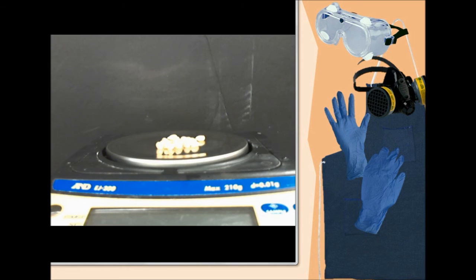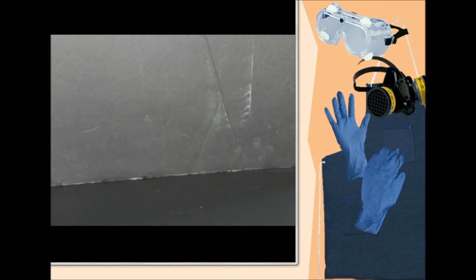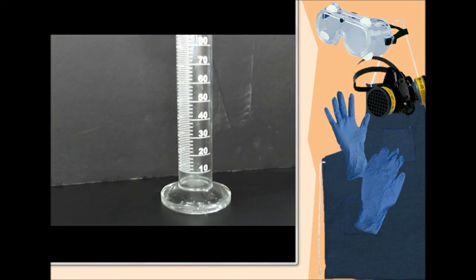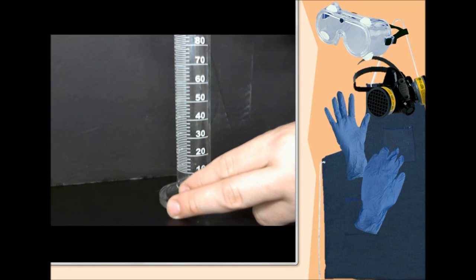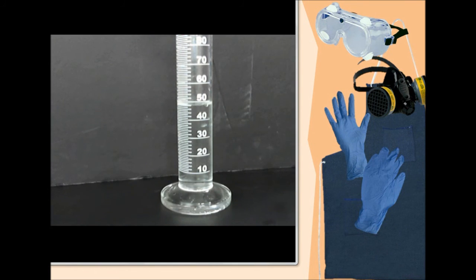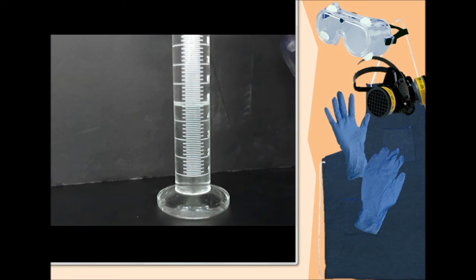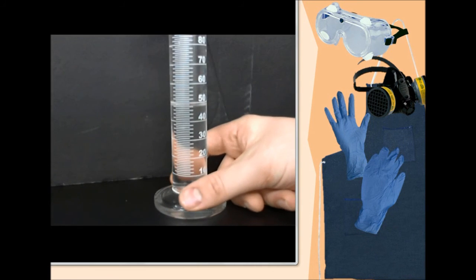Now that I have the mass of these 20 popcorn kernels from the balance, I'm going to remove the balance and the popcorn kernels, I'm going to put in place my graduated cylinder, and the next step is for me to fill my graduated cylinder with a certain amount of water. I'm going to pour the water into the graduated cylinder, and remember it doesn't really matter how much water you use, a good rule of thumb is to fill your graduated cylinder about halfway up the scale. So now I need to read the original water volume in my graduated cylinder. And as I get down really close to the scale, I read this original water volume to be 49.3 milliliters of water.